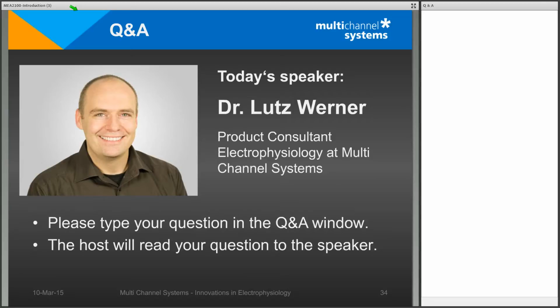Thank you. Another question was about the stimulation: is it possible to stimulate via 3 electrodes simultaneously, or more electrodes simultaneously? Yes, it is possible. You can choose for all electrodes or only one electrode to be recording and or stimulating. So 3 electrodes simultaneously is of course possible. This is sometimes needed if you need to put a lot of voltage into your system to stimulate your cells, for example.